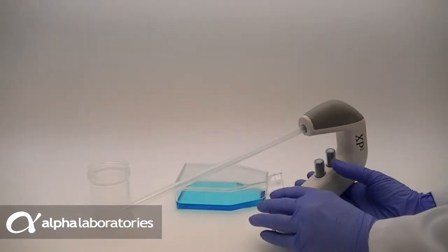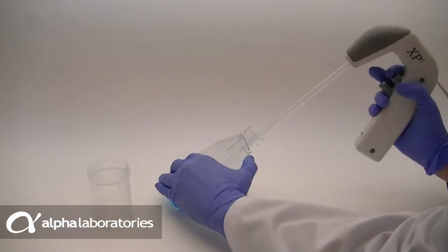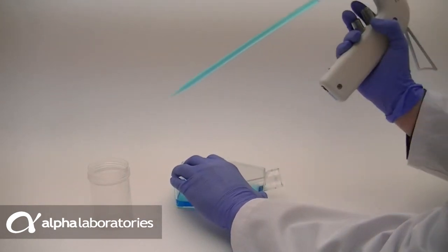Aspirator pastettes have a unique design without a bulb and are open at both ends of the pipette. They can be used with all types of pipette aid devices to aspirate and dispense media and reagents.